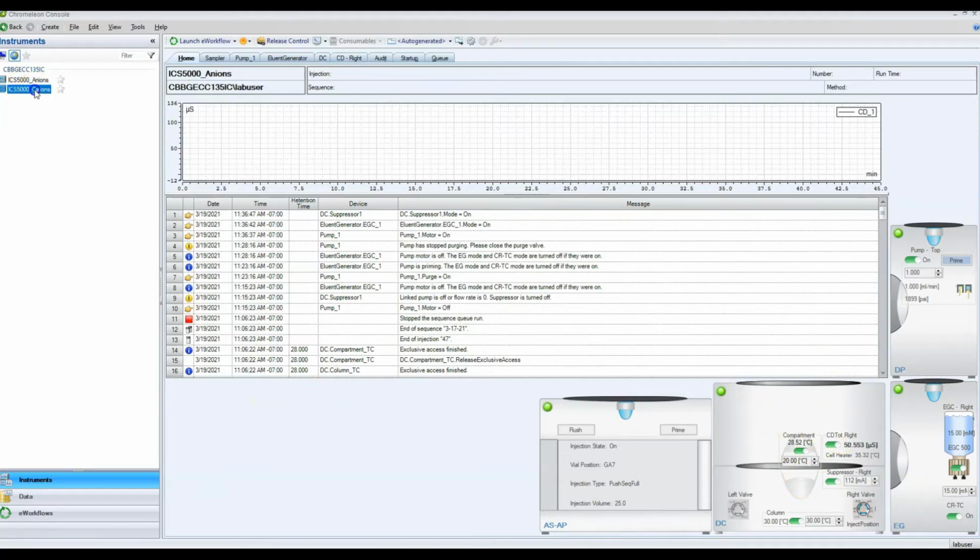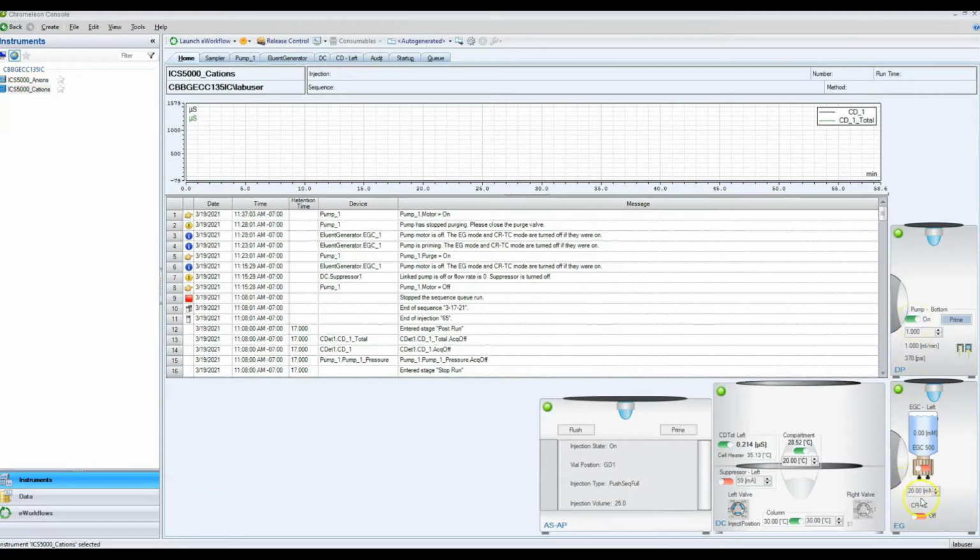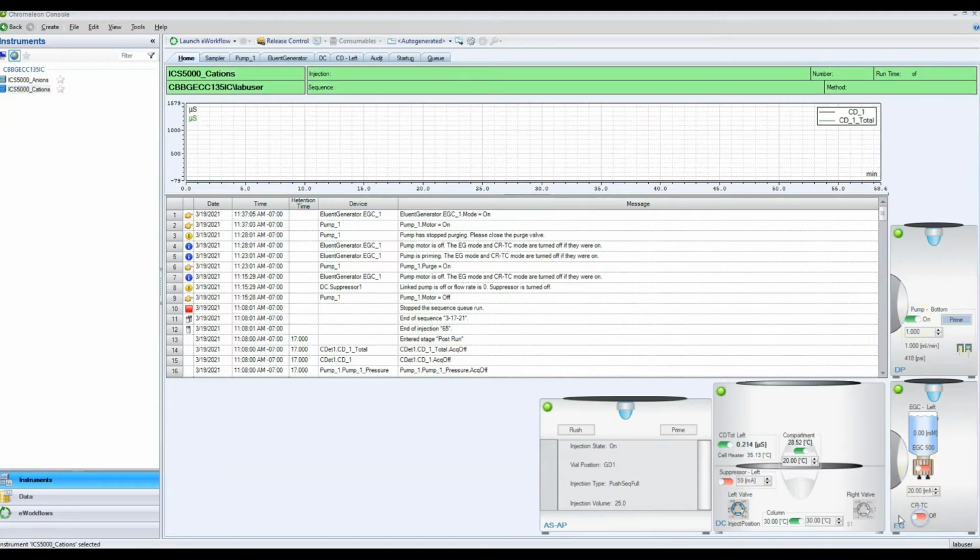Now, we got to do the same thing for the cation side. Different numbers, except for this one. So the pump, still 1 milliliter per minute. Eluent generator, 20 millimolar. And suppressor, 59 milliamps.